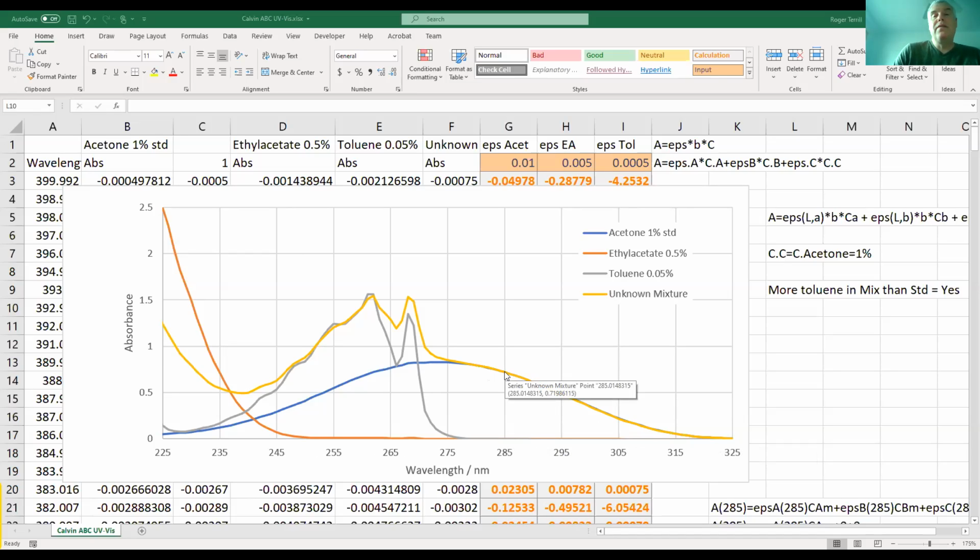That makes sense, Miguel? Yeah. It's kind of like saying, you know, it could be red, green, or blue, right? And we could have amounts of red, amounts of green, and amounts of blue. And if we're looking at the red, and the acetone is the only part that absorbs in the red, and we know the amount that it absorbs in the red, then we can know how much acetone is in the unknown. Okay.